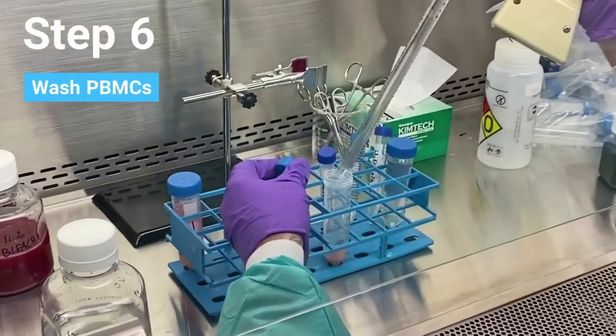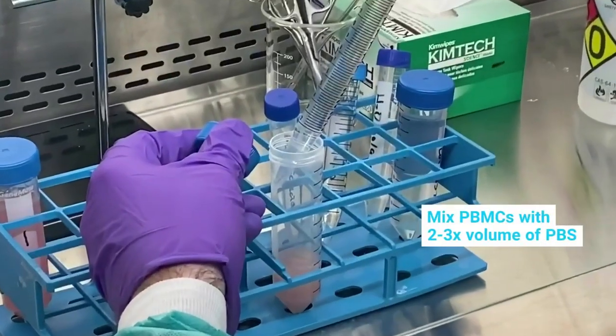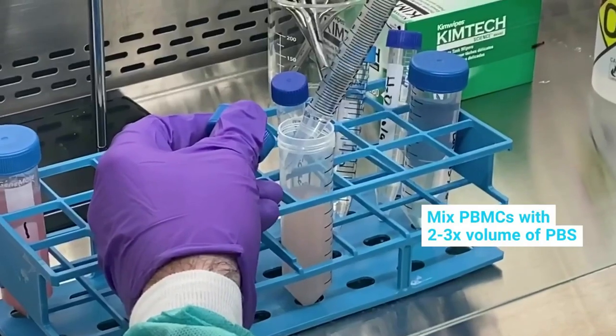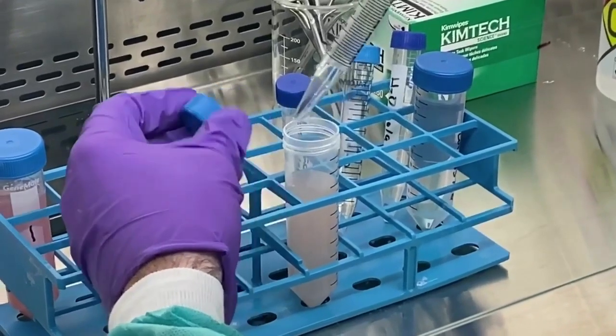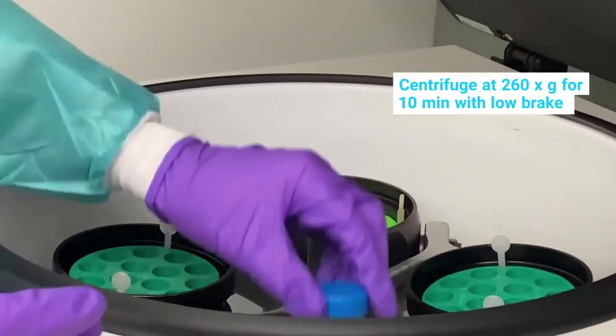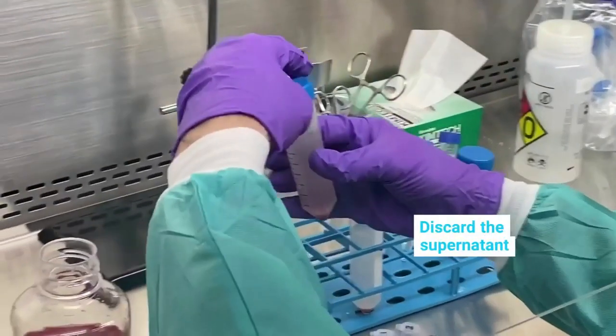Wash the recovered PBMCs by adding between two and three times volume of PBS and centrifuging. Discard the supernatant.